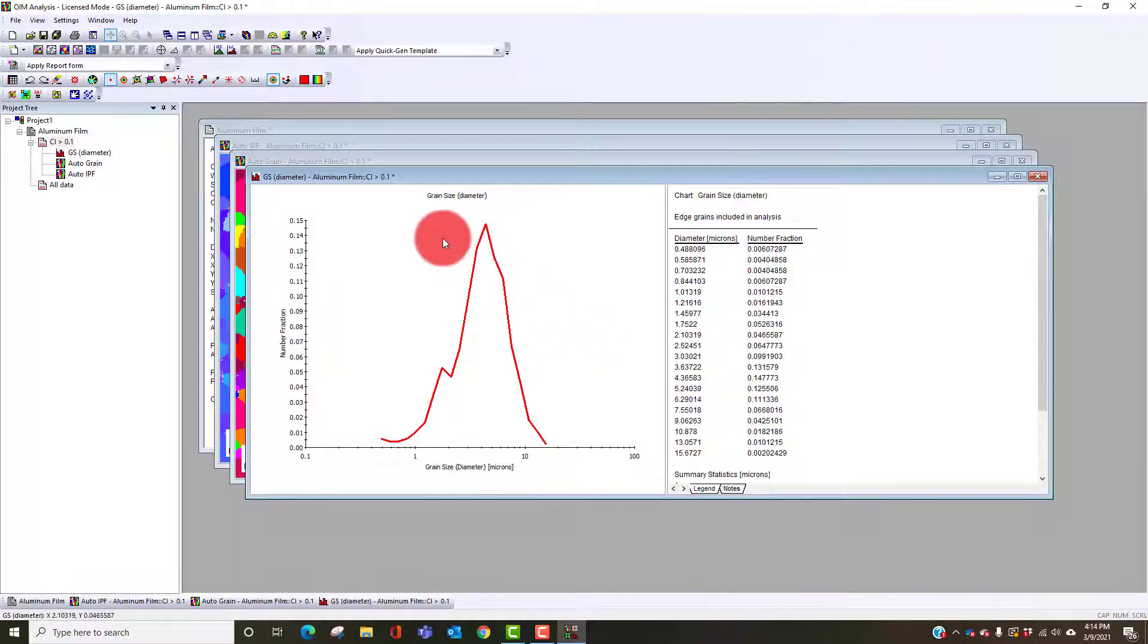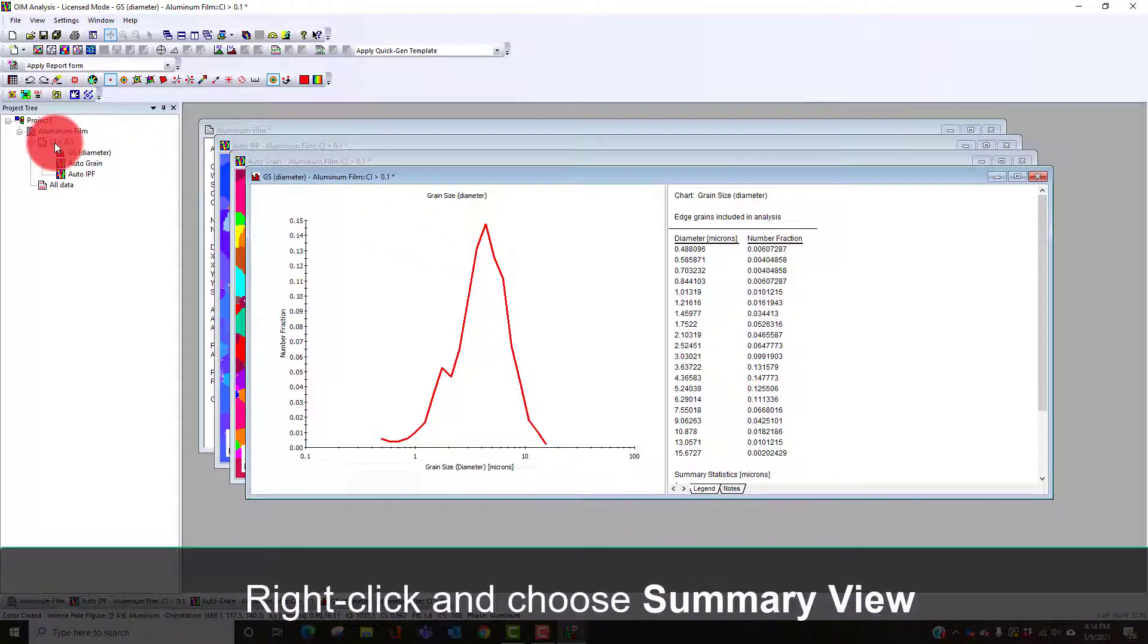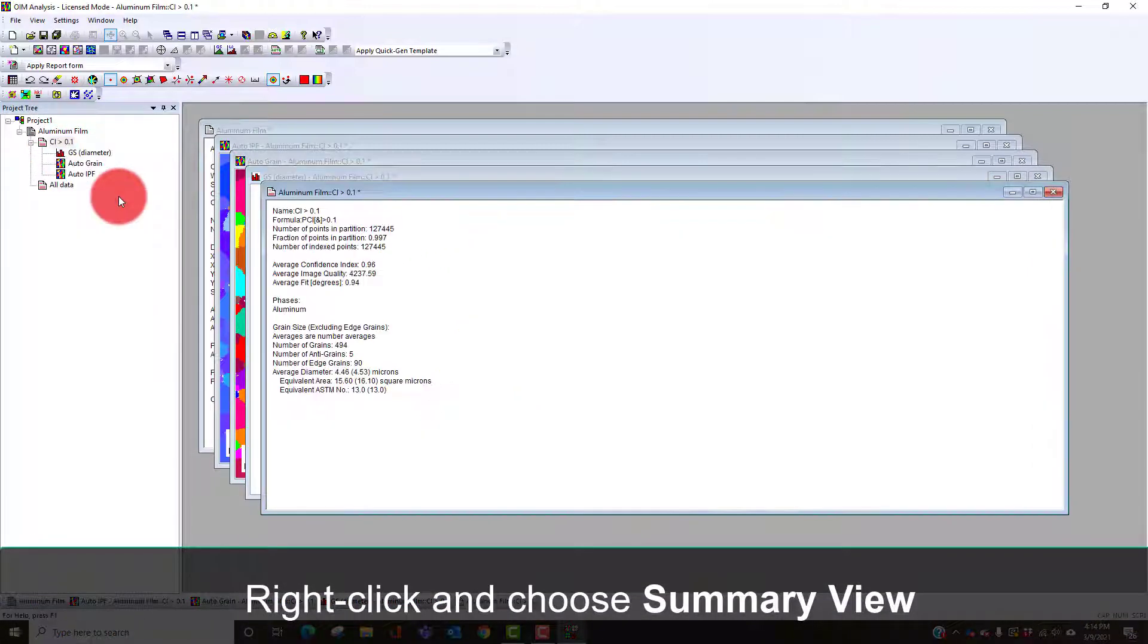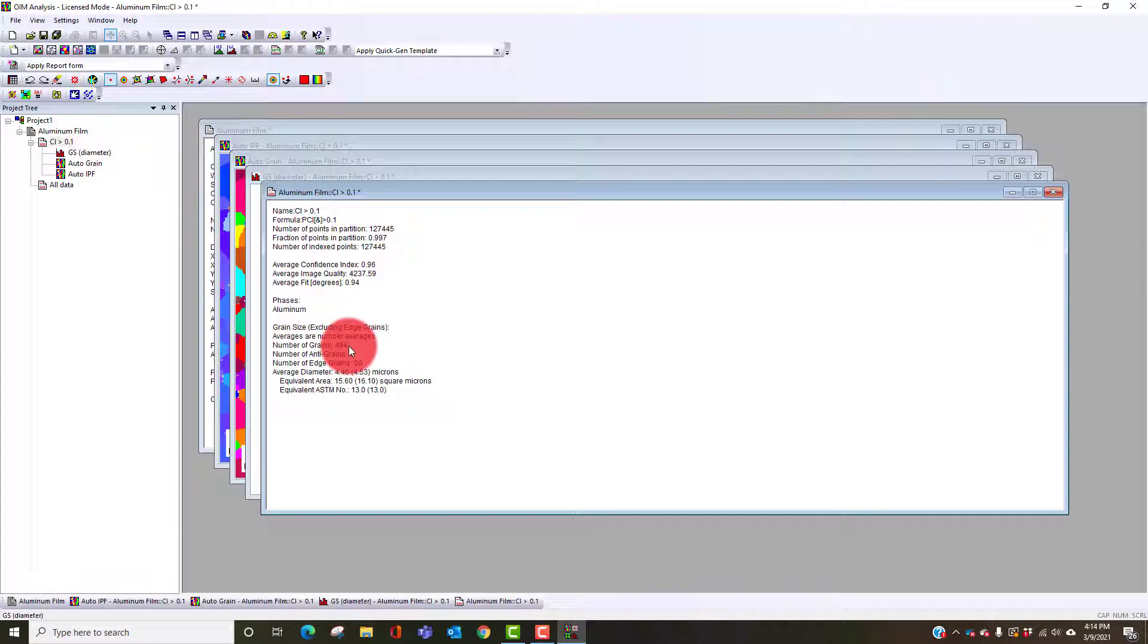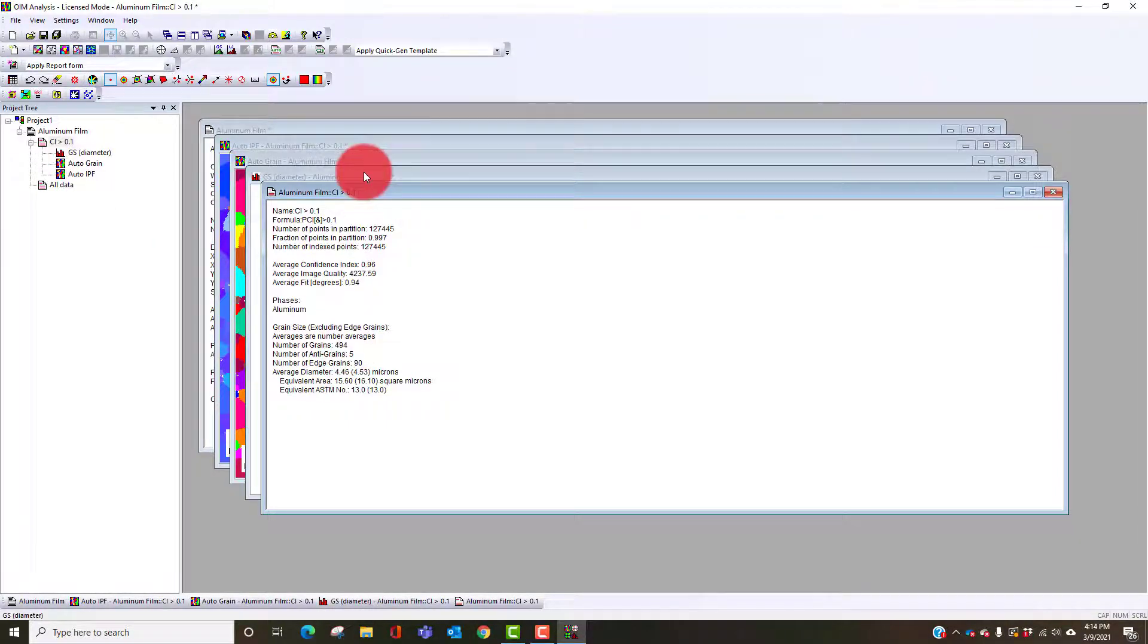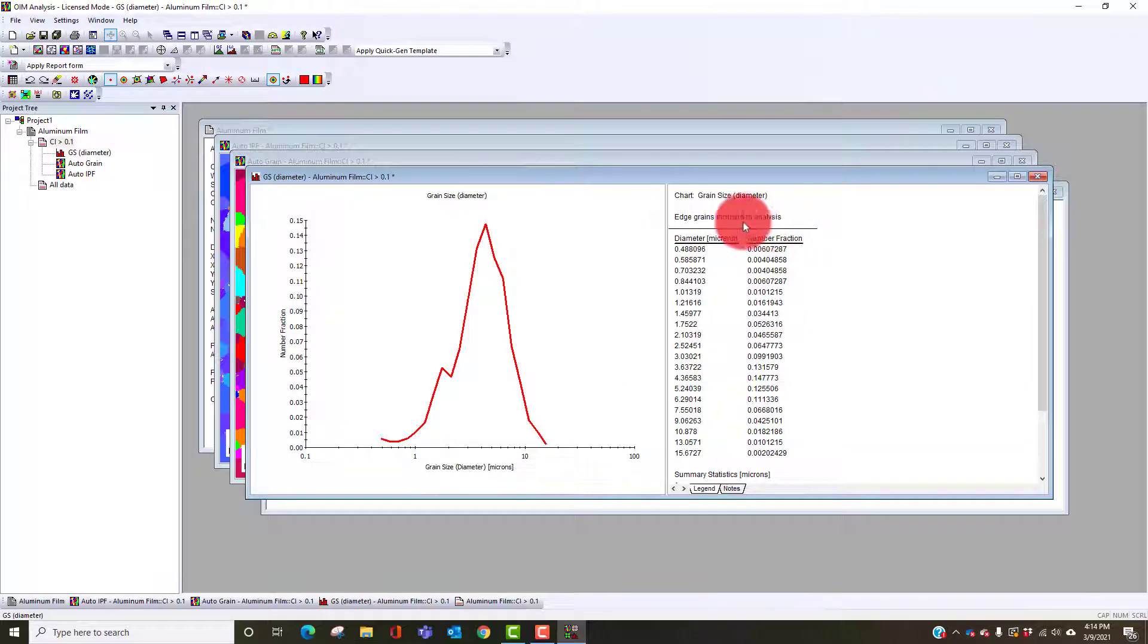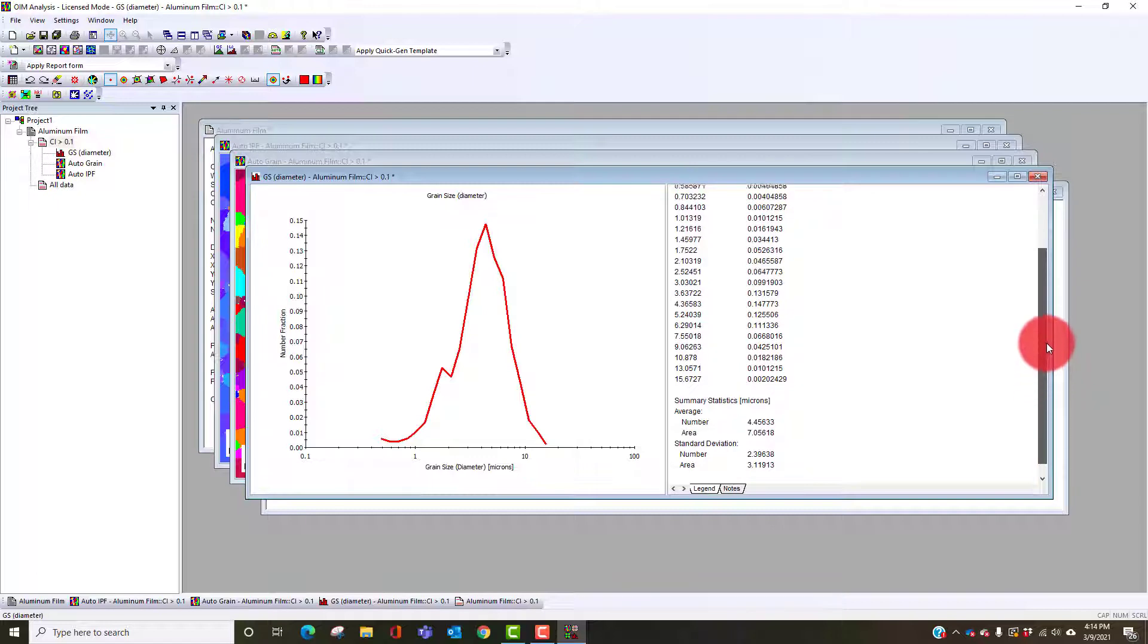If we want to know how many grains are present I can right click and say summary view. It tells me there are 494 grains, 90 of them are edge grains. We have the ability to include or exclude the grains in the calculation.